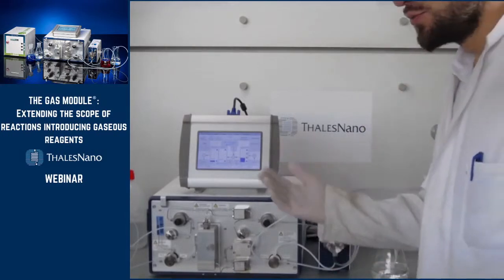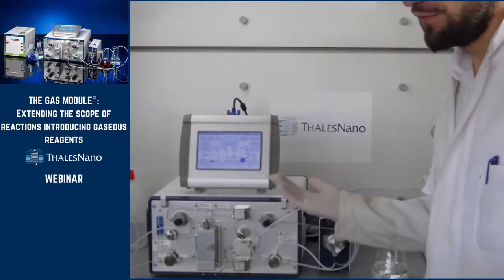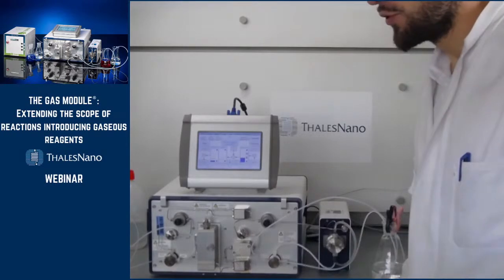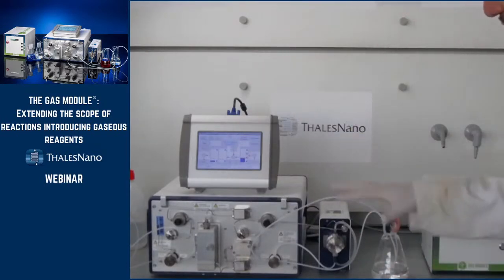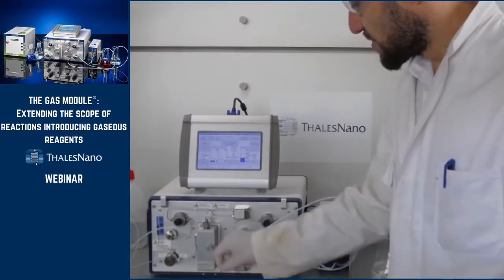So you would need to put another heater, like the Phoenix Flow reactor, for example. And so you can use this connection point to bypass this heater. So it goes to the Phoenix Flow reactor and it comes back later here. So you can bypass this heater. But so let's talk about this heater.